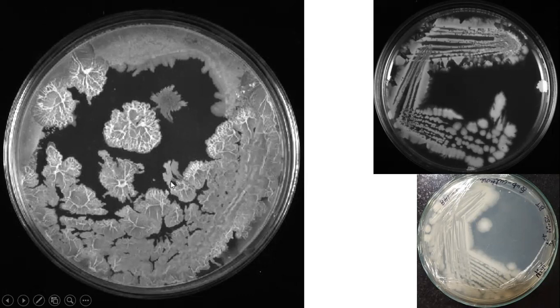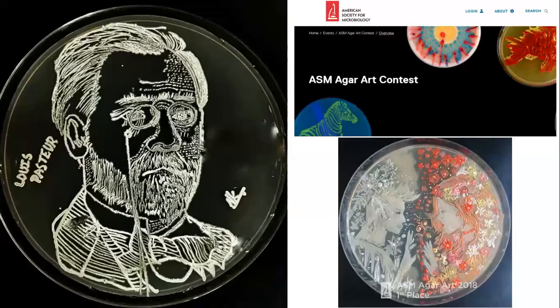But in my experience, when I increase the agar concentration from 1.5% to 3 or 4% agar, you will control the swarming activity and you will get isolated colonies. So it is very essential to have very sharp skills with quadrant streaking, because this is the first basic quality for a microbiologist, that is, to obtain an isolated colony in the last quadrant. Once your skill is very good, you can play with the agar.